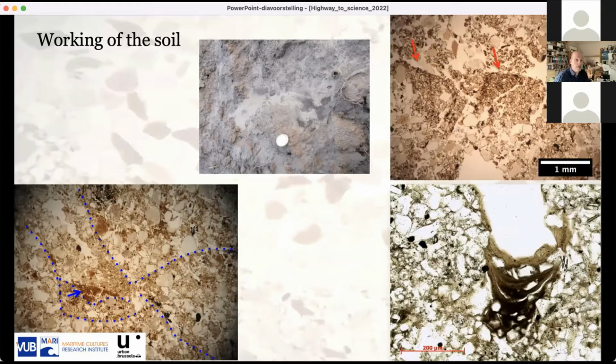It's what we call equifinality. And this is, for instance, the case with what we call dusty clay and clay silt coatings. Now, what are they? Well, sometimes you will see that the pores get filled in or partially filled in with clay material, but it's not pure clay. You see all kinds of impurities in it, and even some silty particles, some larger particles that got incorporated. And this is due to a surface that got disturbed.